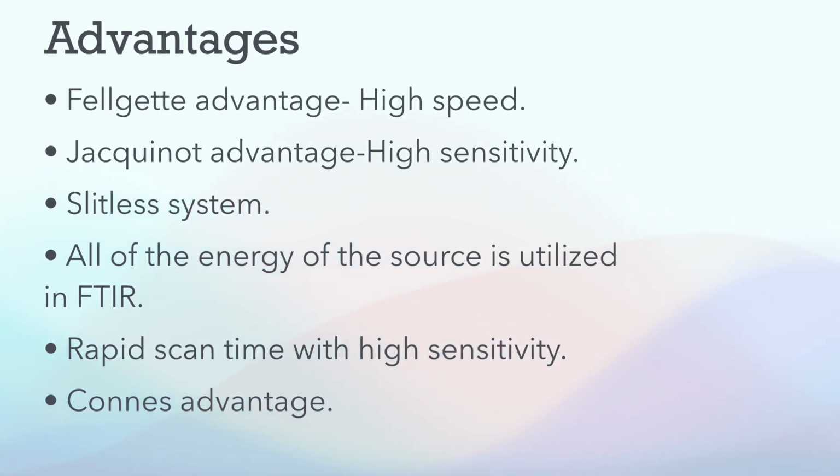Advantages. Fellgett's advantage, high speed. Jacquinot's advantage, high sensitivity. Slitless system. All of the energy of the source is utilized in FTIR. Rapid scan time with high sensitivity.